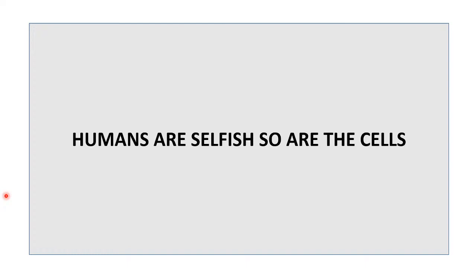You have to design the experiment. You have to analyze the experiment. You have to make your own protocols. You have to understand others' protocols. You are not there to do only pipetting. Pipetting is a daily job. The more important thing is learning the real fundamentals of cell culture.